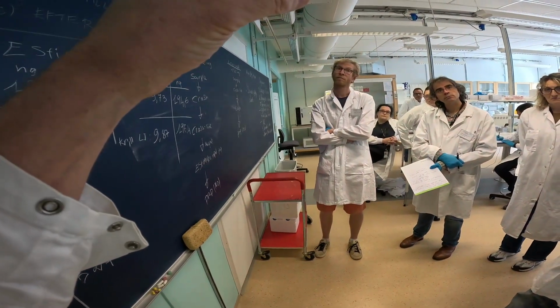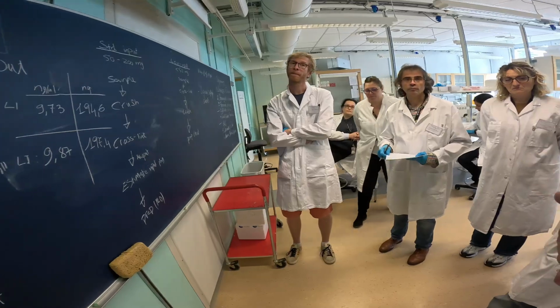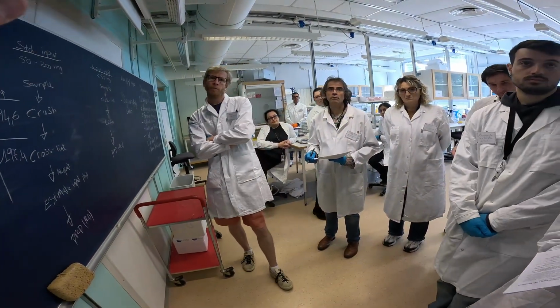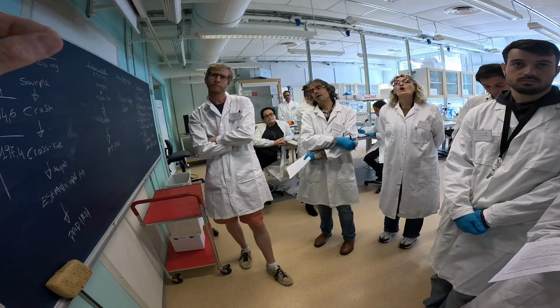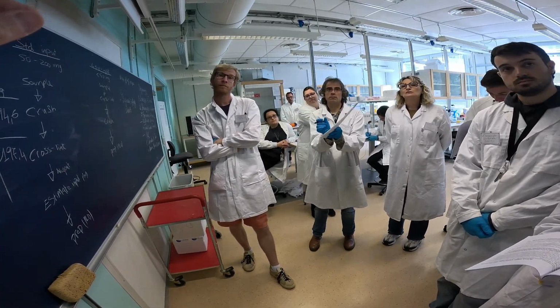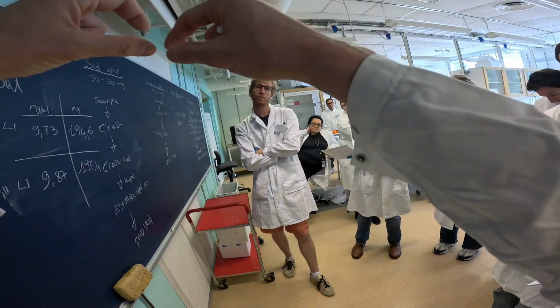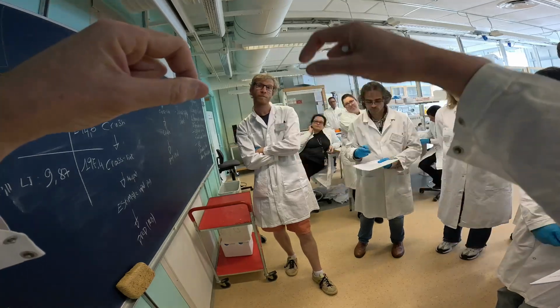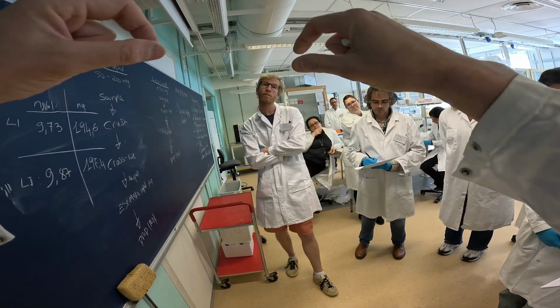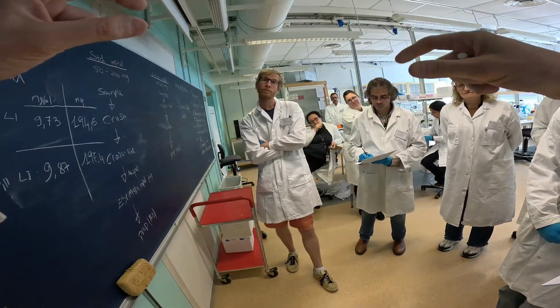is that pellet. Because if you read at the start of the prep, you'll see that the pellet we are using should not occupy more than 20 microliters. You compare it with a tube of 20 microliters. We can make a tube and make a mark on it with some liquid to show the level of the 20 microliters, and then we compare the aliquots we are making to make sure that we are not overshooting too much, because then you are depleting the chemistry and all that.